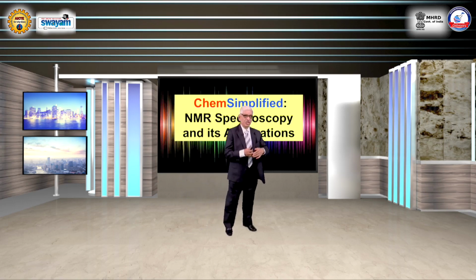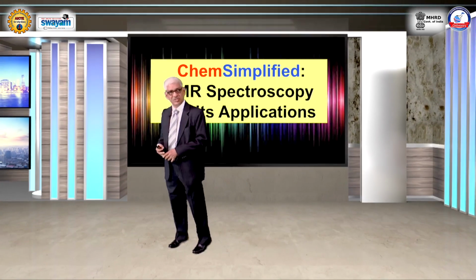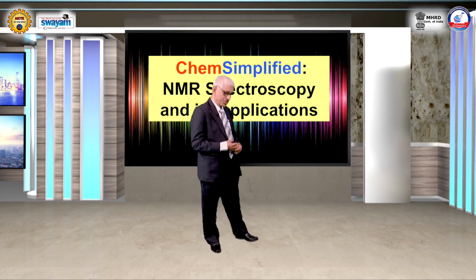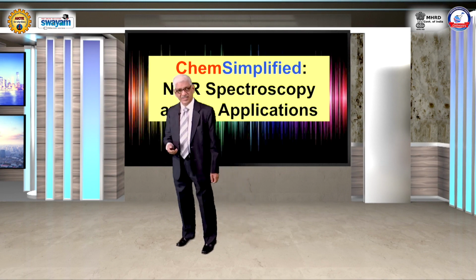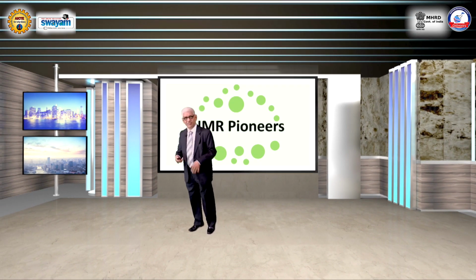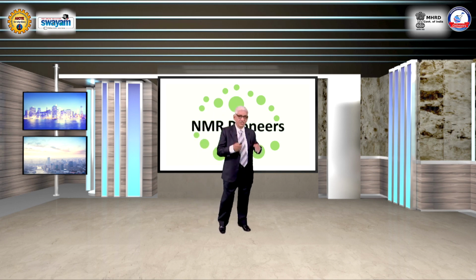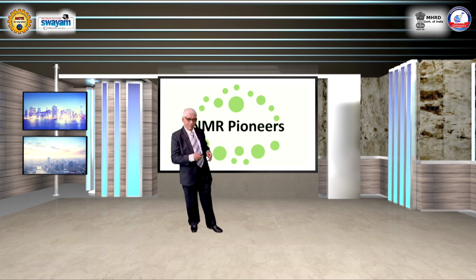In this particular lecture, I am going to tell you about the general principles of NMR spectroscopy and its applications, which will be essential for you to know. So let us start to look at the major pioneers who have contributed to this technique development, and how the technique has evolved over the period of the last 6 or 7 decades. 1945 was the first discovery in the condensed phase, but actually it started even before that.